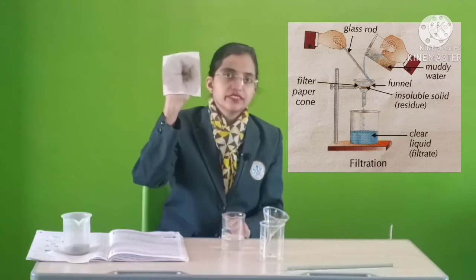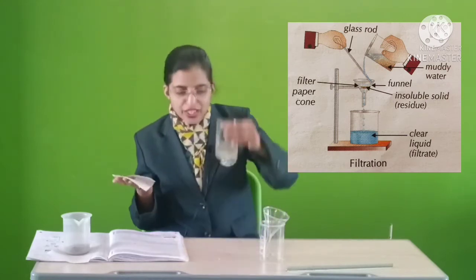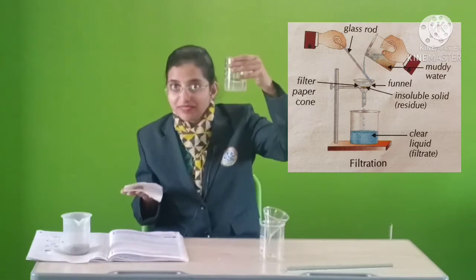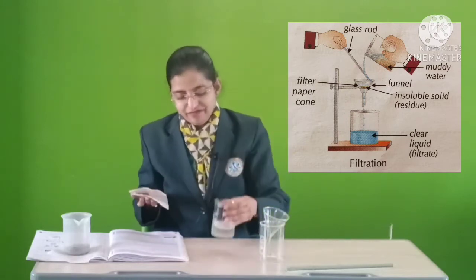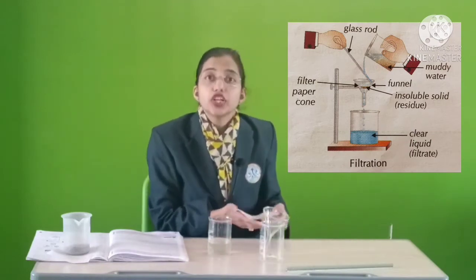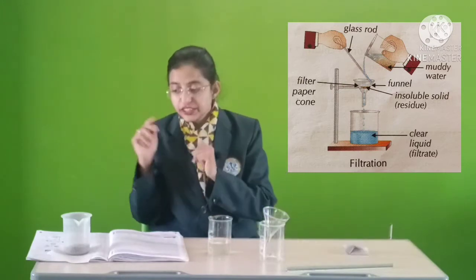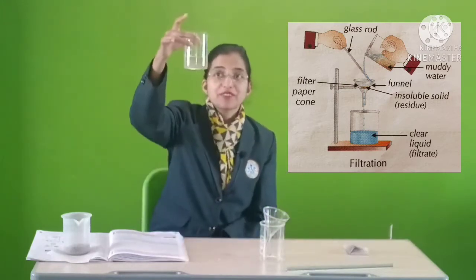See children, this. ये क्या है? ये है residue. And this is our clear water, filtrate water. Okay, filtrate. So this is how we can remove insoluble impurities from water. See, clear water.